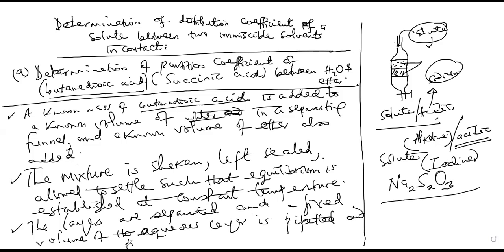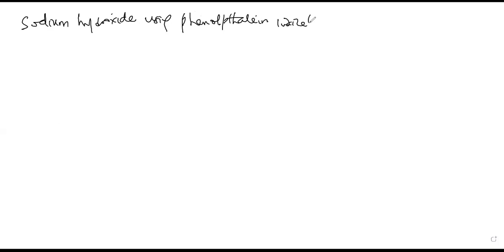and titrated against a standard solution of sodium hydroxide, using which indicator? Phenolphthalein indicator.